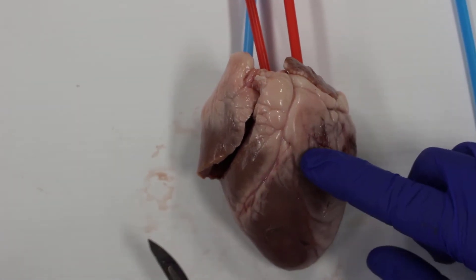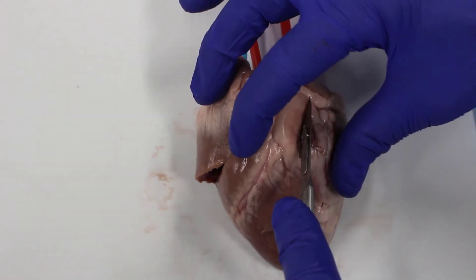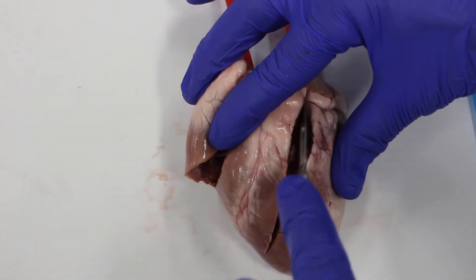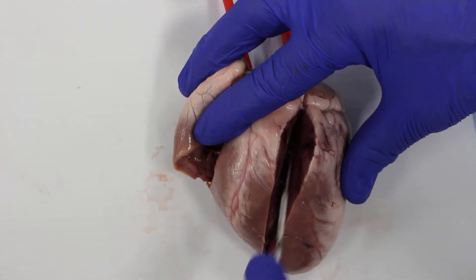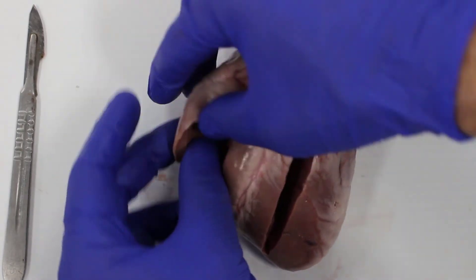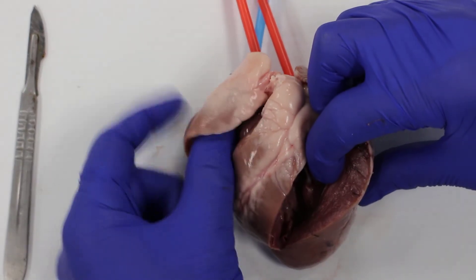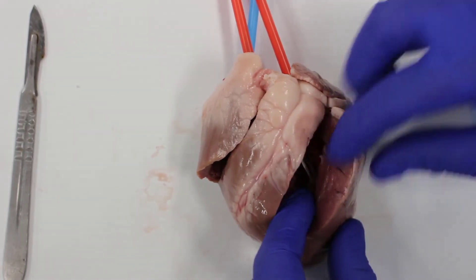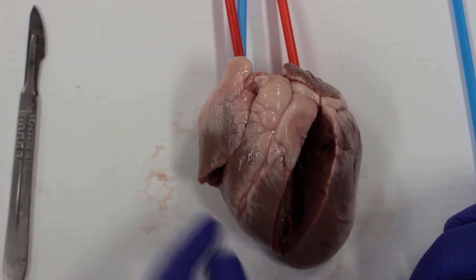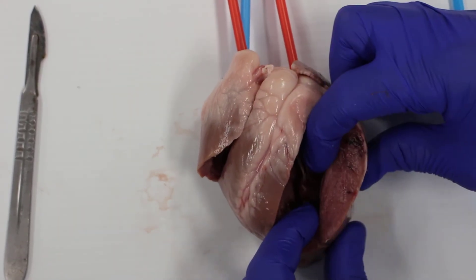We can see the pulmonary artery vessel inside, which was taking blood up to the lungs. Now we're going to open up the left hand side of the heart on the other side of the coronary sulcus. Compare the thickness of the left wall to the right — the left ventricle is much thicker because it has to push blood all around the body, whereas the right side only has to push blood to the lungs.